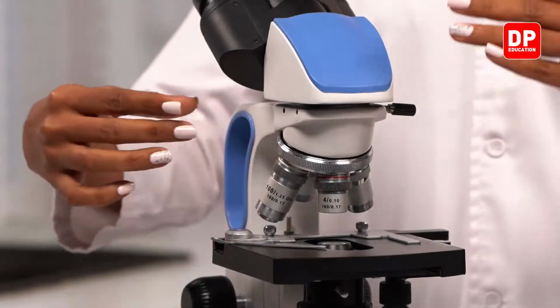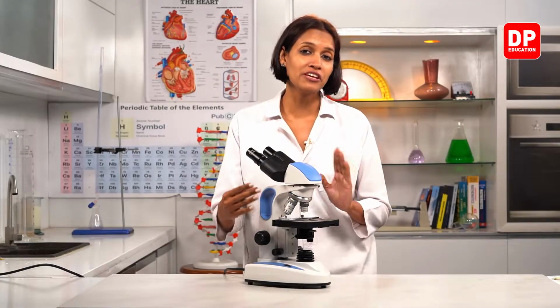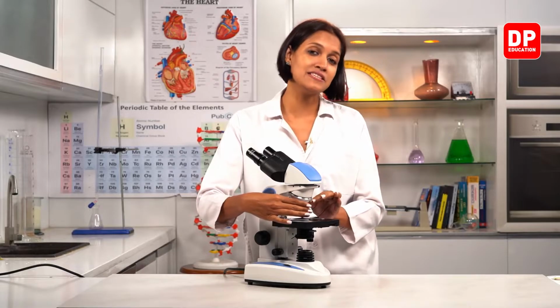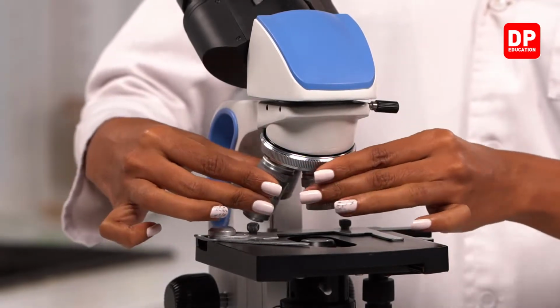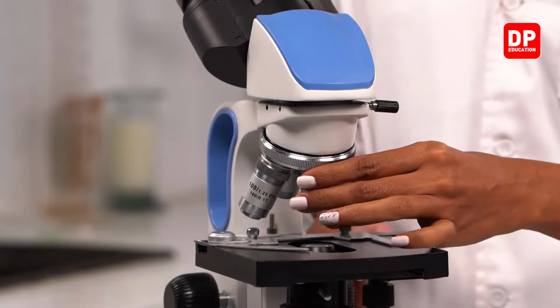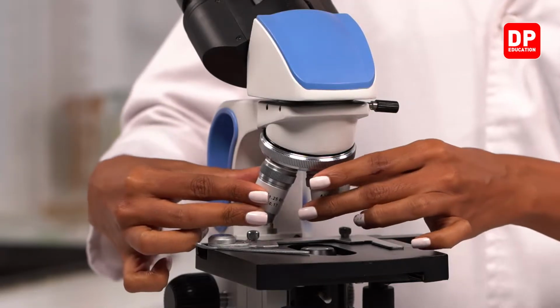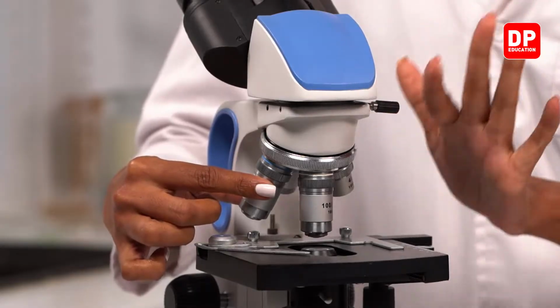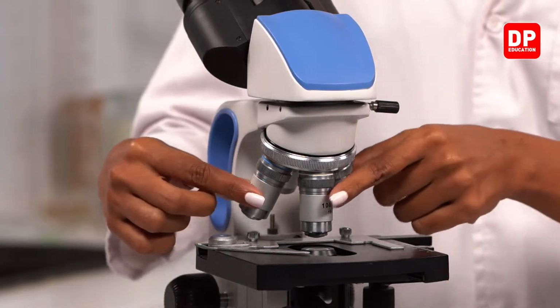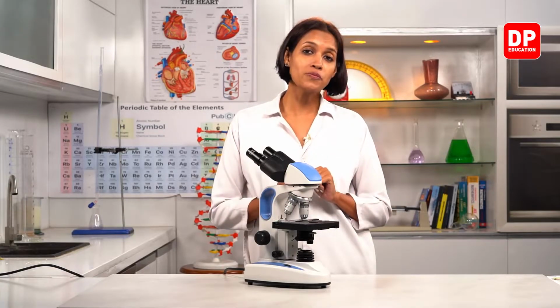Now here, objective lenses are there in three different sizes, magnifications, right? This one, as this is a modern compound light microscope, has 4 sizes. You all can see. Now I can rotate it, very clearly. Whenever we need, according to the need, we can rotate and change it to the required objective. Now why do we call this the objective? Because this lens is the closest to the object or the specimen.